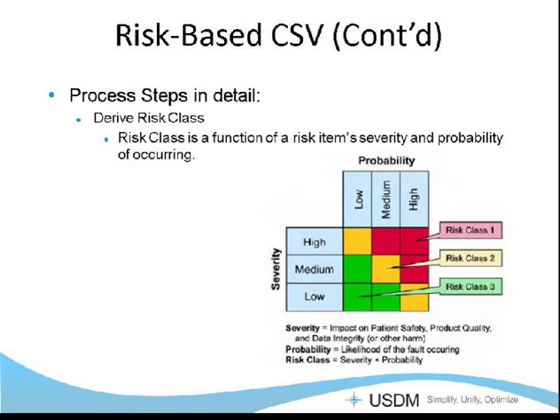So let's say that we have a lab system that's used for quality control, and you have a requirement that you need to be able to control an HPLC through this system. You need to be able to start the HPLC system through the software. So our risk, we need to go through first, and we need to say, what is the real risk? The real risk is that you put a run on that HPLC, you start the system through the software, and the system never starts.